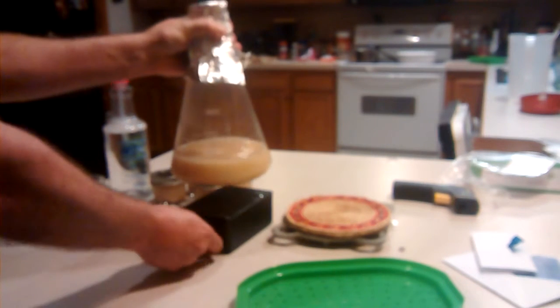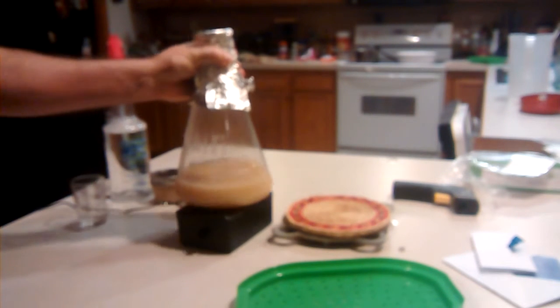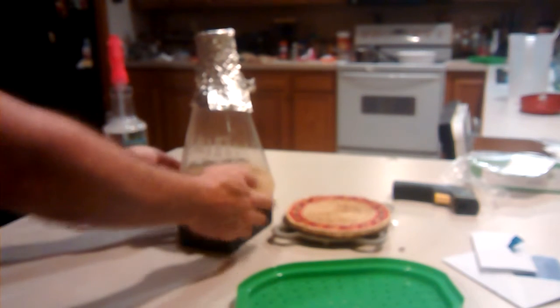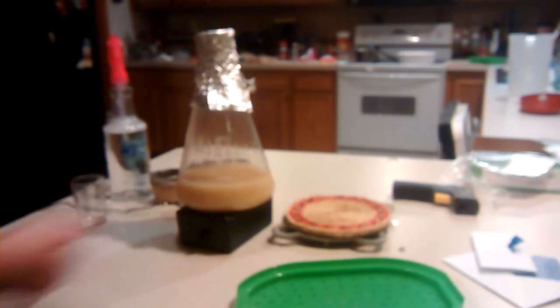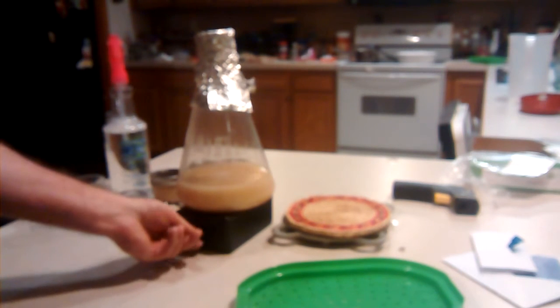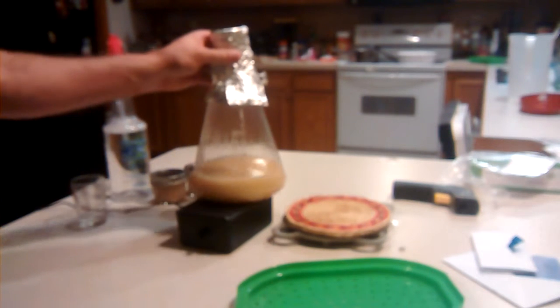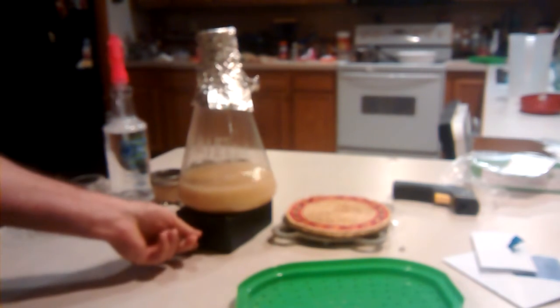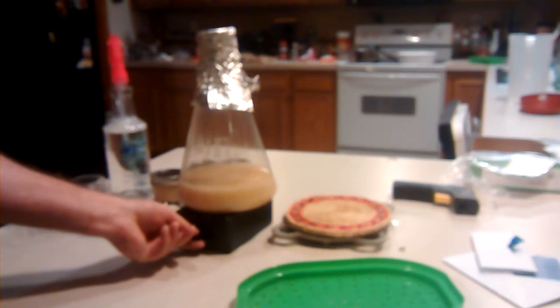Oh, I'll turn it off for a minute, so I can get the stirrer back on the magnet properly and try it again. I think I found it. There it goes. Swirly, swirly. Turn her down a little bit.